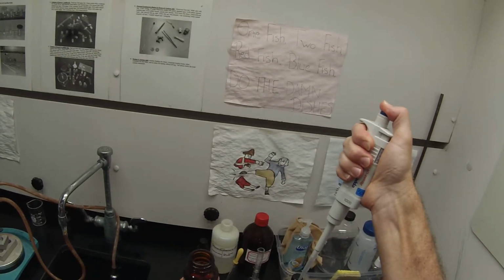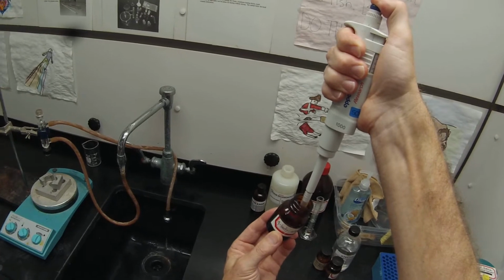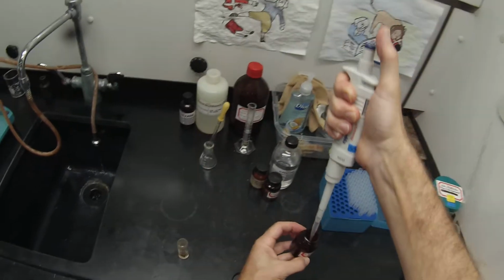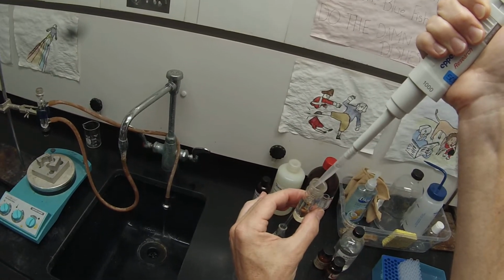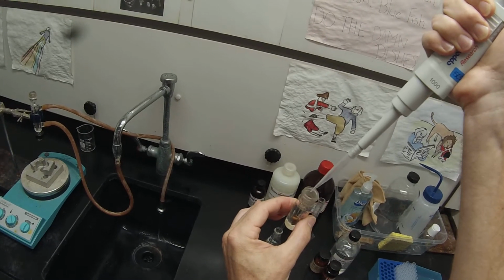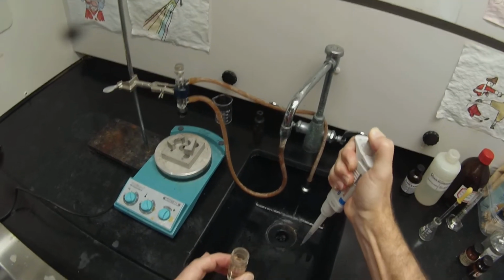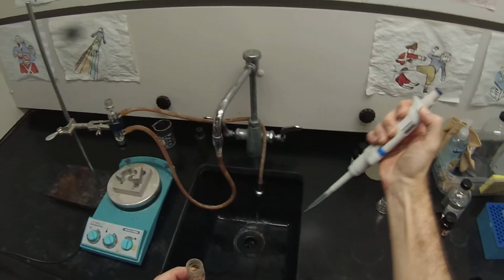So we'll press it down to the first stop. Slowly pull up our 913 microliters of n-butanol, and then we'll add that down the side. It's going to float and it's going to generate a little bit of heat, and then just to get that little bit out of the tip, I press it down to the second stop, and then if you press it really hard, the tip falls out, and this dispenses my tip.